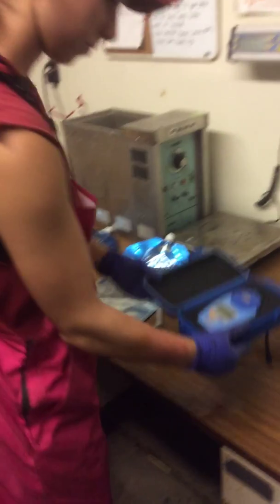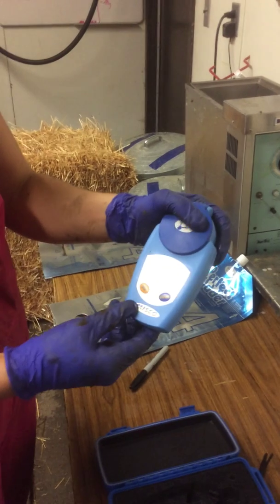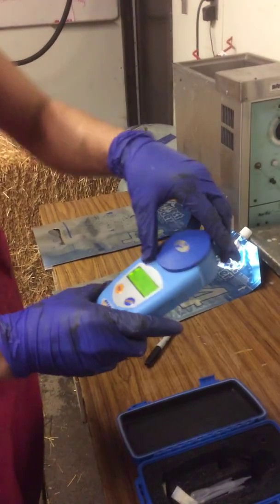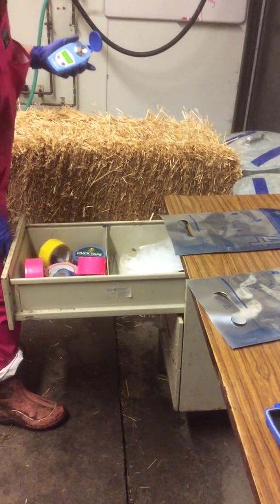The BRICS is inside the blue case. Open it up and press the go button on the left. You can then flip the top open and grab a pipette dropper.